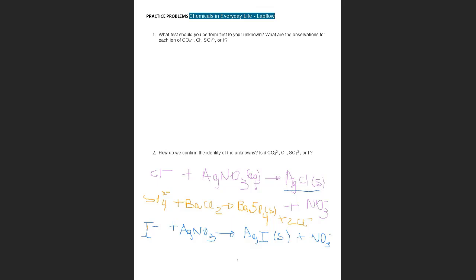That is one way. Another option is when we add bleach. Remember what we said. When we add bleach, we have a reaction. The bleach is exactly as if it has chlorine dissolved. So when the chlorine, we saw it before, reacts with iodide, it produces iodine.